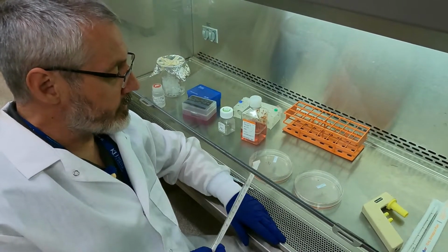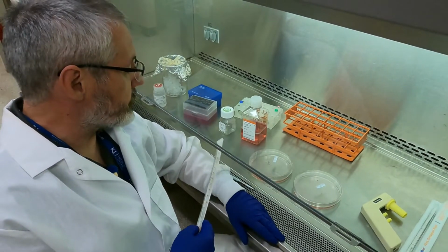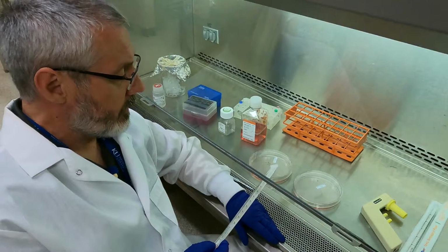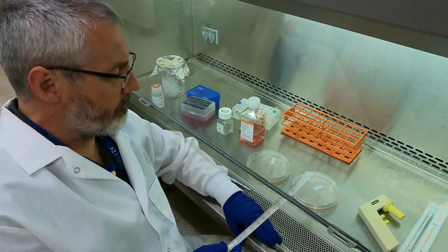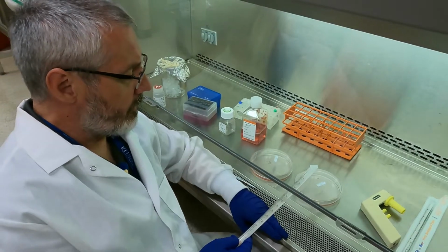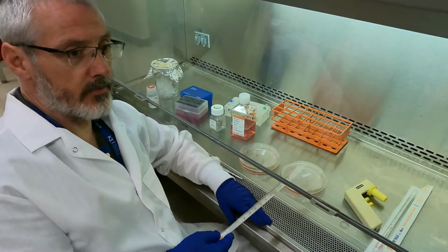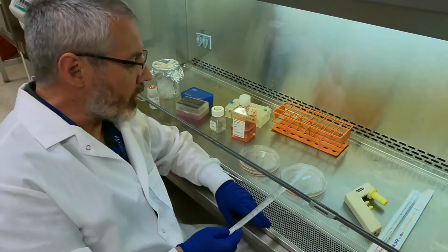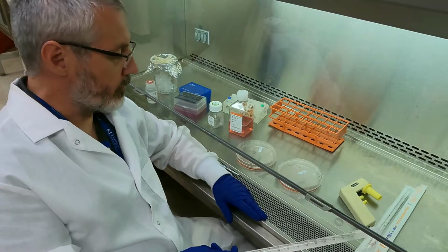So what we want to do is basically knock these genes out using the Cas12 and the Neon transfection system, and use them as targets for our various monoclonal antibodies that we made. So if we knock out the genes in these, there will be negative controls for the monoclonals.